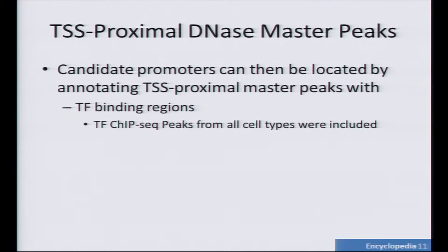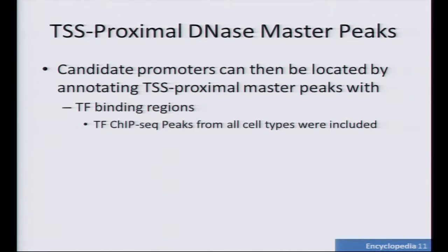Now we can actually start looking at annotating candidate promoters. For us, a candidate promoter is going to be two things: first, a TSS proximal master peak; and second, it's going to have an annotation with a TF binding site. For now, we use all the ChIP-seq TFs — all either gap peak or narrow peak — from ENCODE. We did a large bedtools merge and built an annotation track, and these peaks are also TSS proximal.